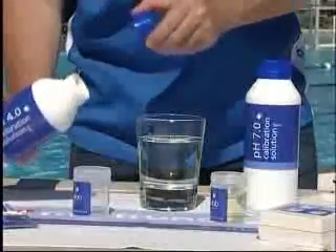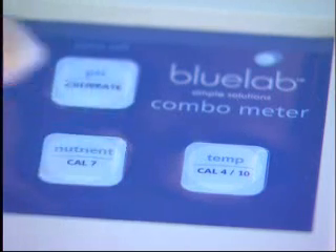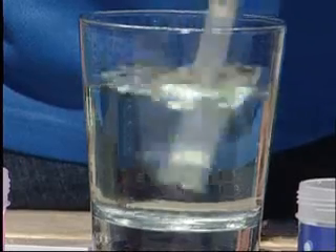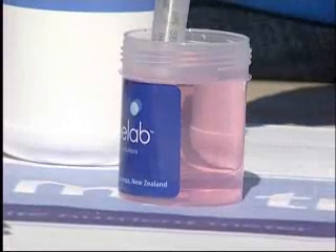Calibration of the combo meter is simple. Pour a sample of each calibration solution into two decanter vessels. Place the probe into the pH 7 solution until the measurement stabilises. Press and hold the CAL7 button until the on-screen display flashes. Release and press CAL7 once. A steady 7.0 will be displayed on screen. Rinse the probe in fresh water and place the probe in either pH 4 or pH 10 calibration solution.